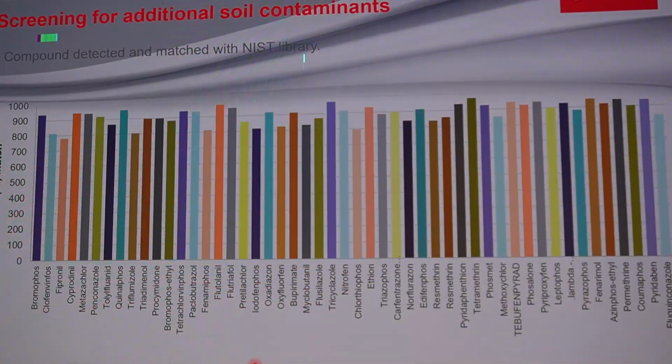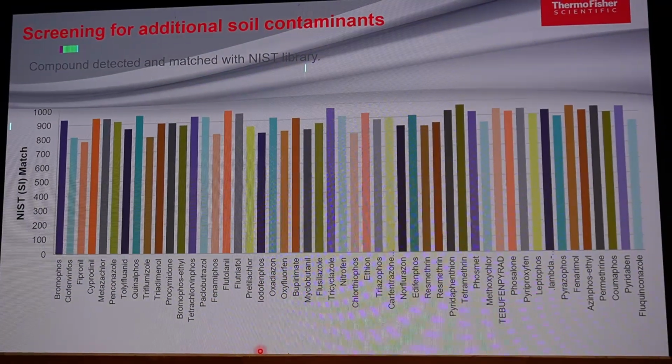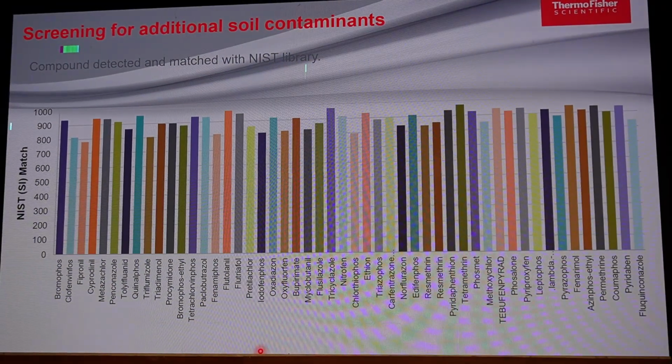Then, as I mentioned, the sample preparation and everything has been done for PAH and PCB in the soil sample matrix, but parallelly, through screening, you can look for pesticides in that same extract. You can do screening as an untargeted approach, or pull out additional information from that same data. If any pesticide or other contaminants are already present in the soil, you can easily pull out that information. And this is the best example.